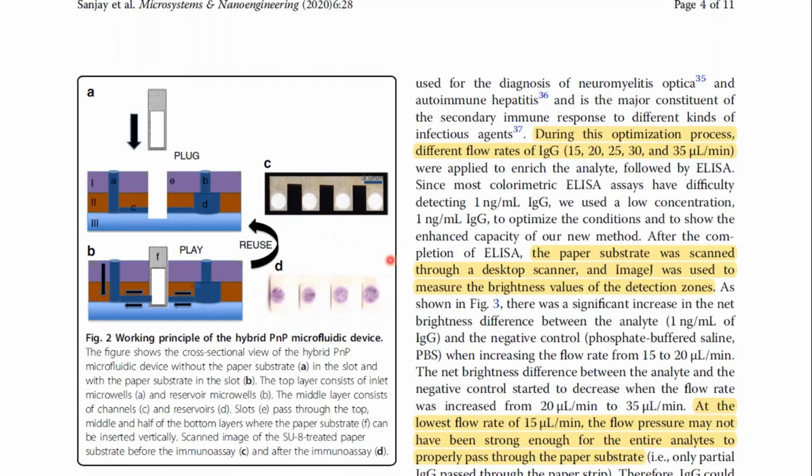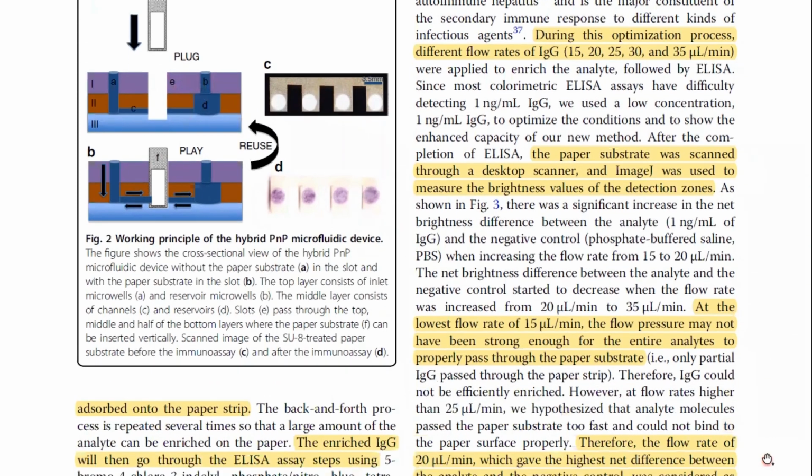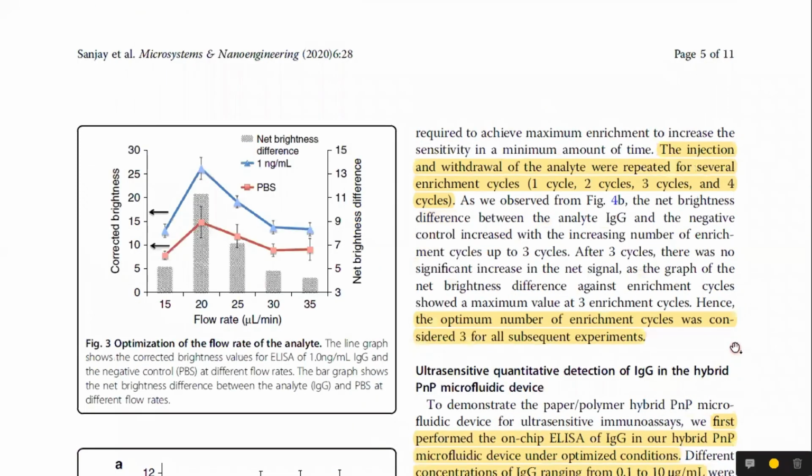In this paper, they used both. They compared only the paper device and the paper device together with the PMMA frame. So we are going to see how this performed in the results. Before that, they optimized the flow rate of the analyte. We can see here the results that they came out with.